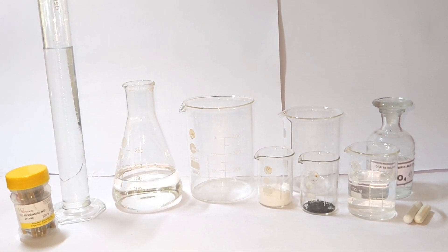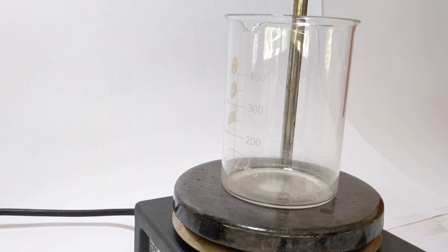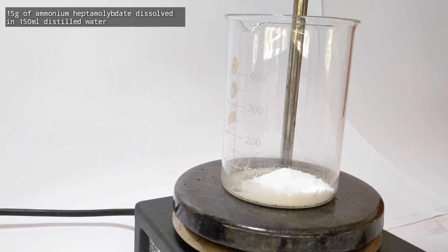A 500 milliliter beaker was placed on a hot plate stirrer and 15 grams of ammonium heptamolybdate was added. A stirring bar was then placed in the beaker and 150 milliliters of distilled water was added to it.